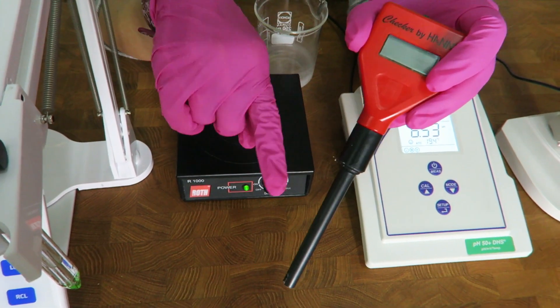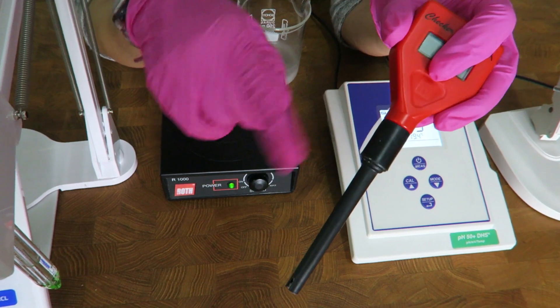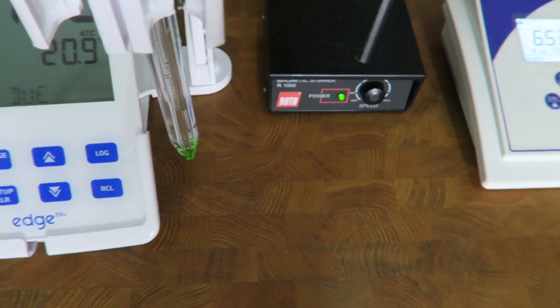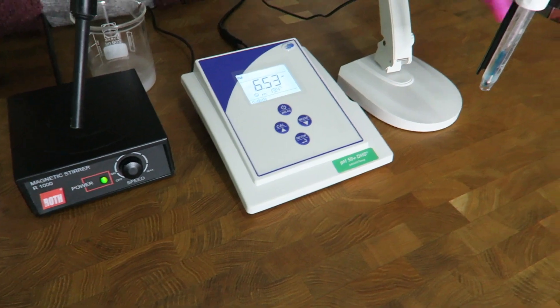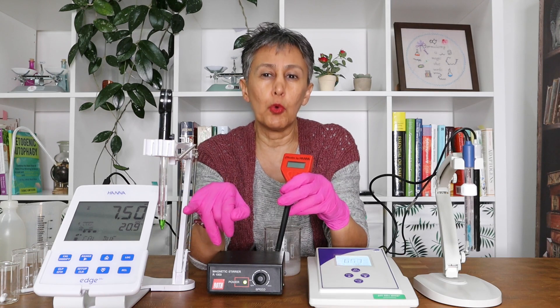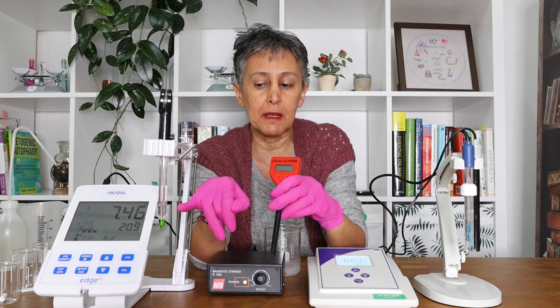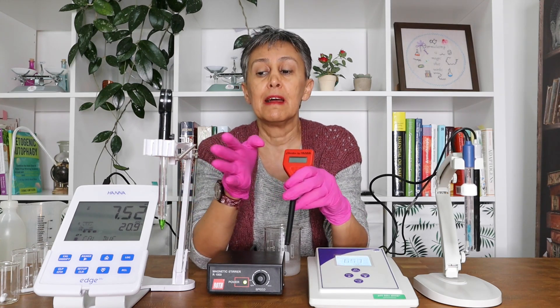pH electrodes come in different models and shapes. This is one shape — the simplest one from the Hana Checker Plus. This is the pointed, more fanciful one, and these are some rather standard models. This is the heart and soul of your pH meter, so you have to take care of it like it is the apple of your eye, because the precision of the measurement and the whole function of the pH meter depends on the precision and accuracy of the electrode.